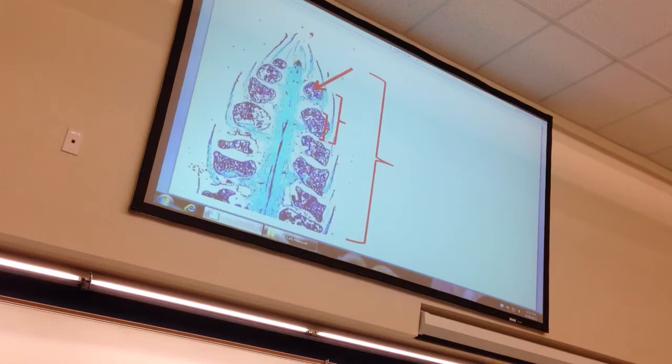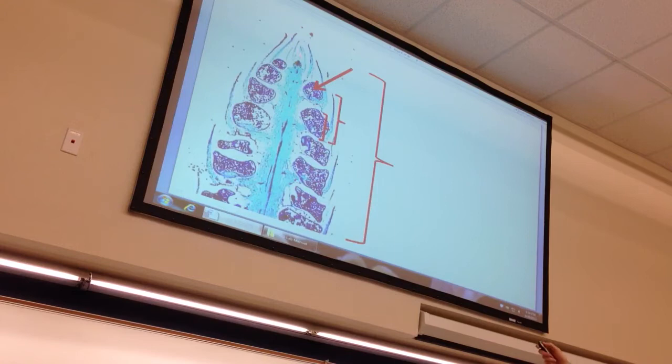And this is the strobilis. Then what would be the name of this whole structure here that's circular, that has cells inside? Sporangia. And then if the cells inside here are haploid, what would be the name of those cells? Spores. How about if they're diploid? Spore mother cells. Spore mother cells are the cells in biology that undergo meiosis. So whole thing strobilis, spores, sporangia, and then this bracket is for this pointy structure.